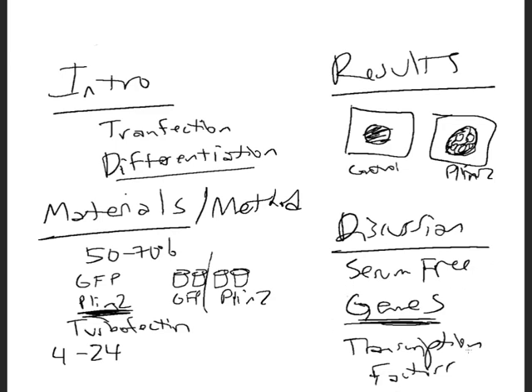So as you write the discussion, go through some of the issues that are pretty prevalent in the transfection protocol. Talk about how things can dry out and how you would solve that with maybe a rocker and whatnot. And then obviously get into some of the theory behind that. So it's not too difficult of a write-up.